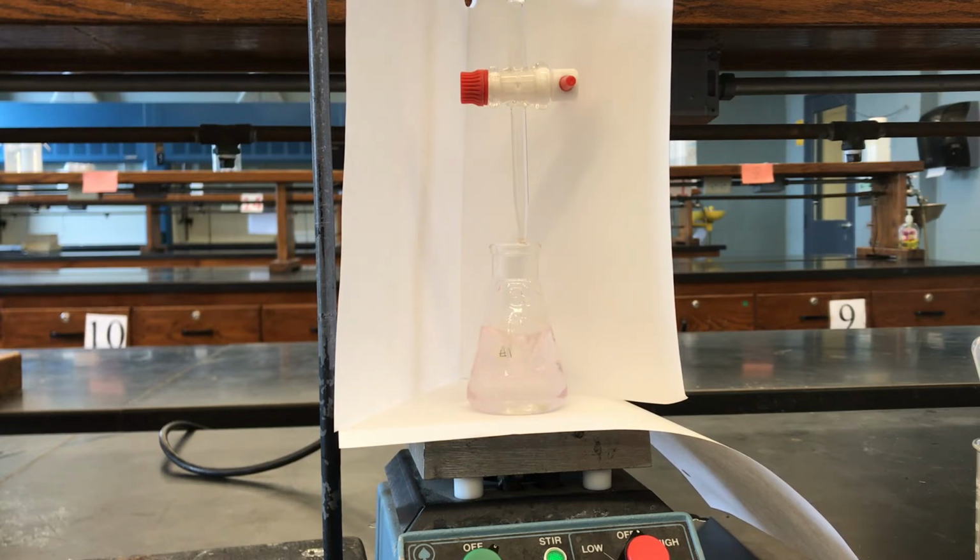And you can see here that we are fading back to clear, so that will happen. So when you found just the right end point, the pale pink only persists for about a minute, and then it fades back to clear. So this is like the perfect titration.